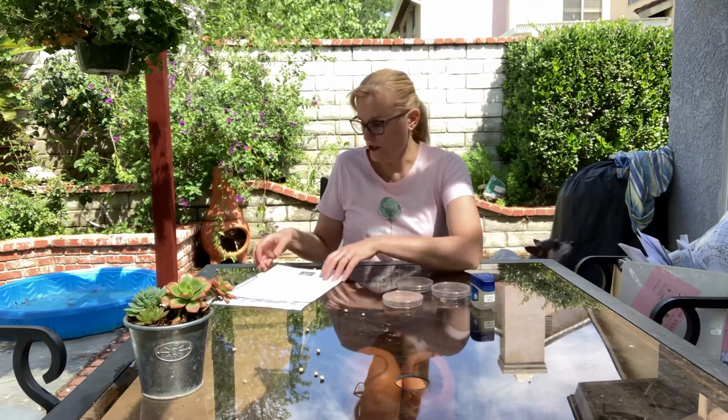I have enough Petri dishes that each student can take home 2 Petri dishes, and then one is a control. So I have groups of 4, so I have 9 Petri dishes per lab group. They come up with a question. So at this point in the year, they've done controlled experiments. They've also done some more experimental design. And so I don't need to check them very much.